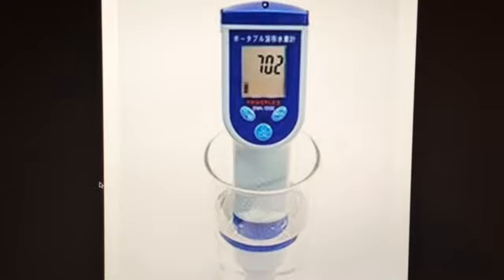This thing should be used for swimming pools or hot tubs. Using or buying such a device is a waste of money. It's not accurate. If you see a company that relies on such a device to show you how much hydrogen a product is making, you need to question their information and knowledge about hydrogen in general, because this shows ignorance.